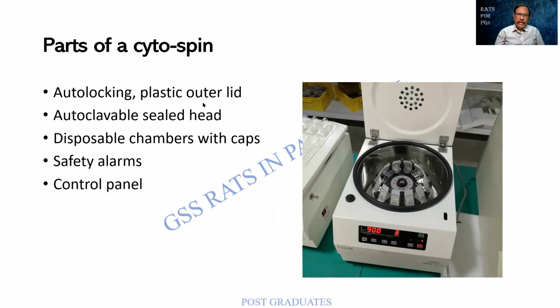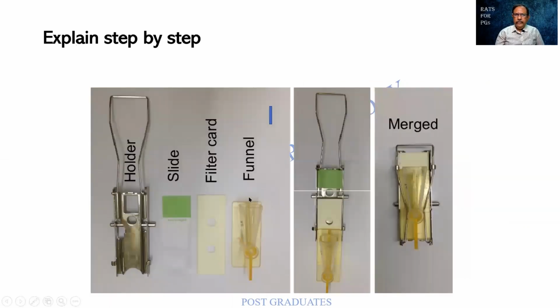So these are all the parts of the cytospin. Kindly do make a note of it. Try rehearsing it after I have said. This is an extremely important one. In some centers they are routinely using it, whereas in some others it will be just Greek and Latin.